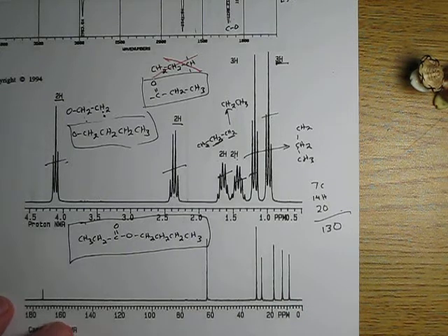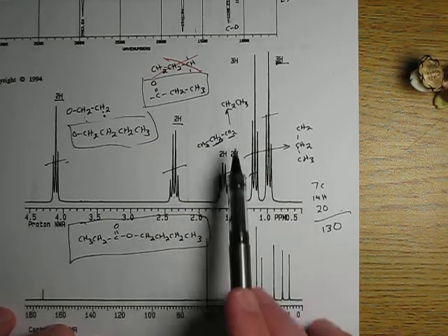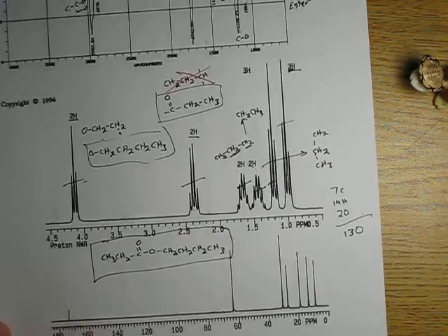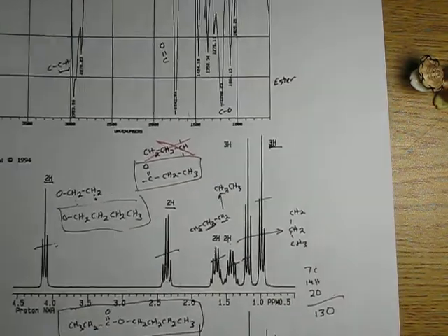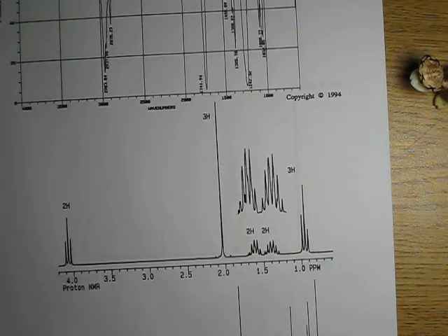Although CH2s made it a little tricky, we could figure it out. And check it out, it is an ester, just like the IR kind of led me to believe. All right. Whew. That was fun. Let's do another one.